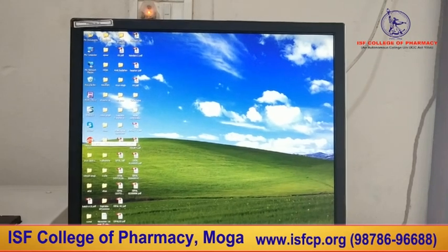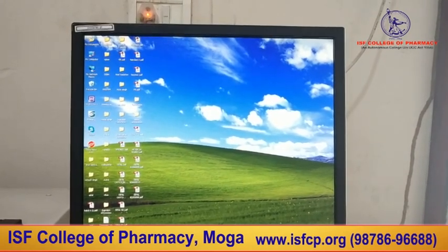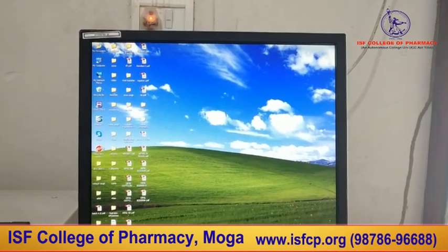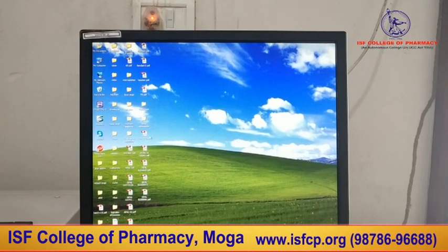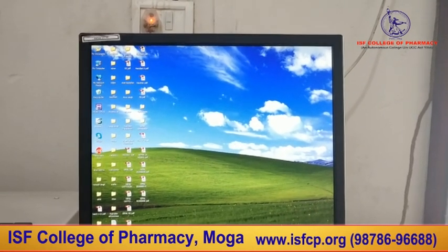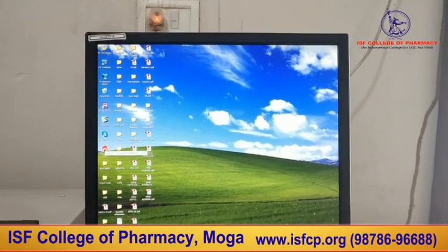Friends, we are going to measure particle size using the Delsa Nano C sizer, but before that we need to install Delsa Nano 2.21 software in our respective desktop as well as laptop. Let's open the software and see the proceedings of this software.